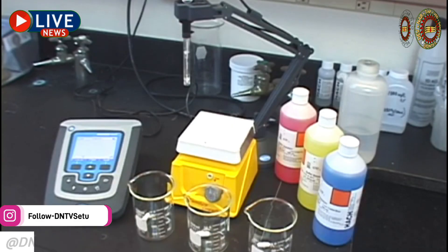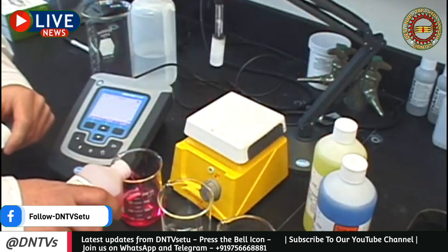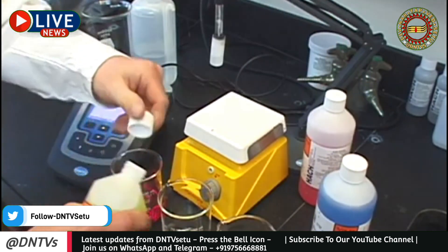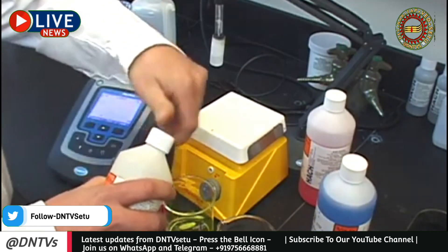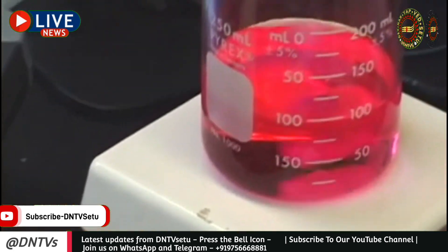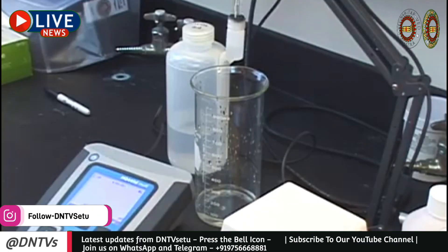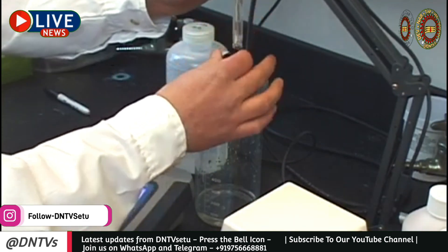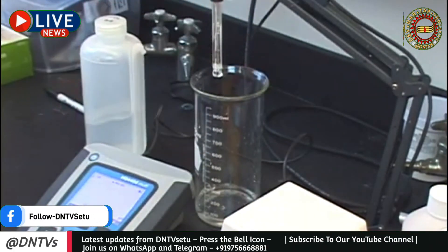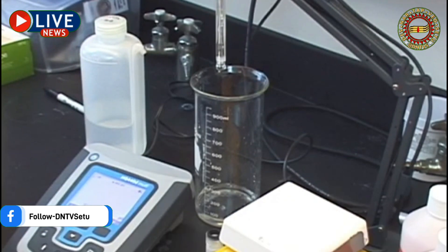Now we're ready to calibrate our meter. When calibrating, it's essential that you have enough buffer to immerse not only the bulb but also the electrode junction — the more buffer you have, the less chance of introducing contamination. Start by pouring the buffers required to bracket your expected pH result. Second, adjust your stir rate to a slow to moderate setting; using a stir ensures the highest level of accuracy and also helps with response time. Next, remove your electrode from its storage solution and rinse it in deionized water. Once rinsed, blot the electrode — be sure not to wipe the glass bulb, as it could influence your calibration and measurement.